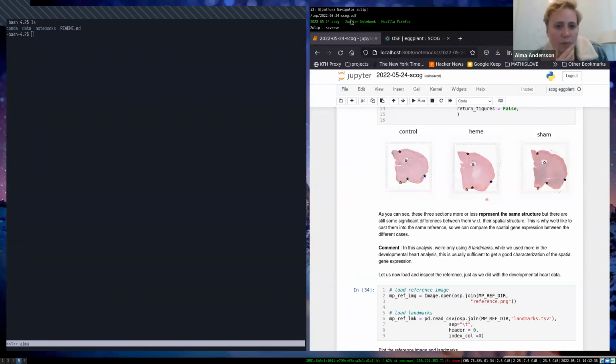So for me, when I'm constructing these references, I try to look at the main characteristics of the tissue, what elements or shapes seem to be present or prevalent in all of the sections, or in the majority of the sections, that I would like to transfer information from, and then make some sort of average representation. But you could also, maybe in the case where you actually have image data, just pick one of the images and make a reference out of that.